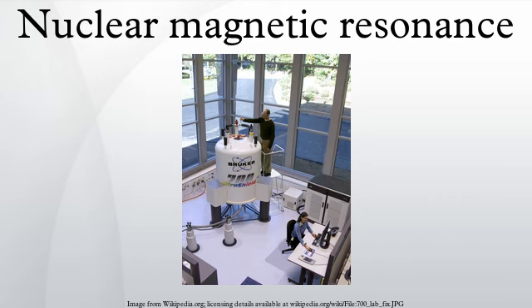Both T1 and T2 depend on the rate of molecular motions as well as the gyromagnetic ratios of both the resonating nuclei and their strongly interacting, next neighbor nuclei that are not at resonance. A Hahn echo decay experiment can be used to measure the dephasing time, as shown in the animation below. The size of the echo is recorded for different spacings of the two pulses. This reveals that coherence which is not refocused by the pulse. In simple cases, an exponential decay is measured which is described by the T2 time.